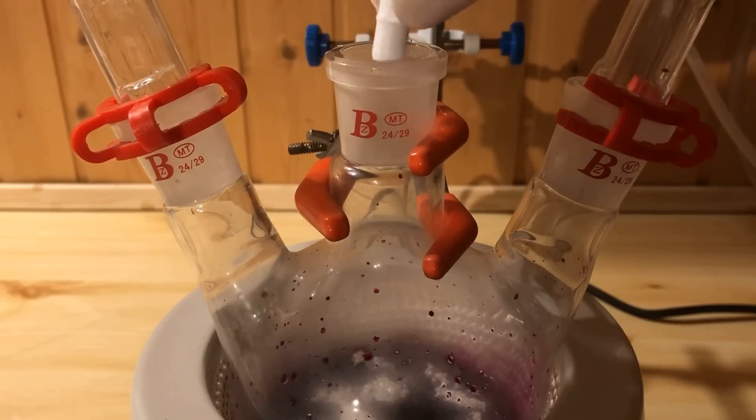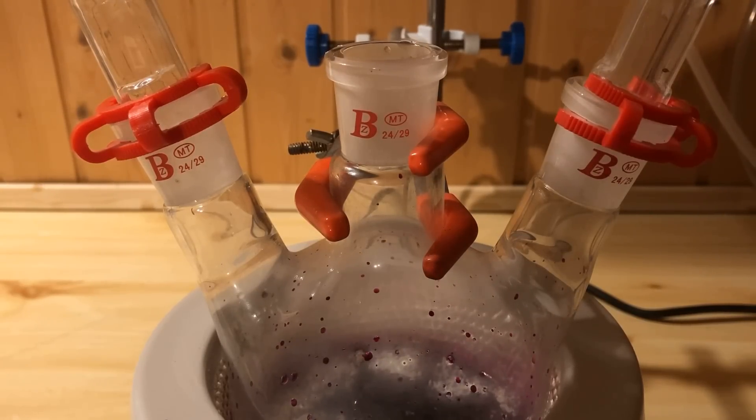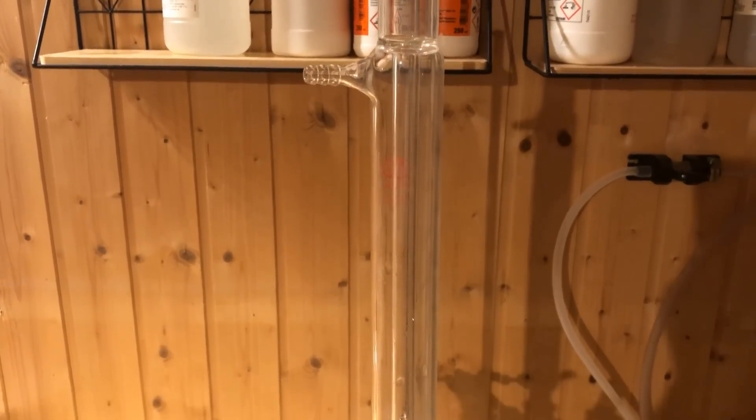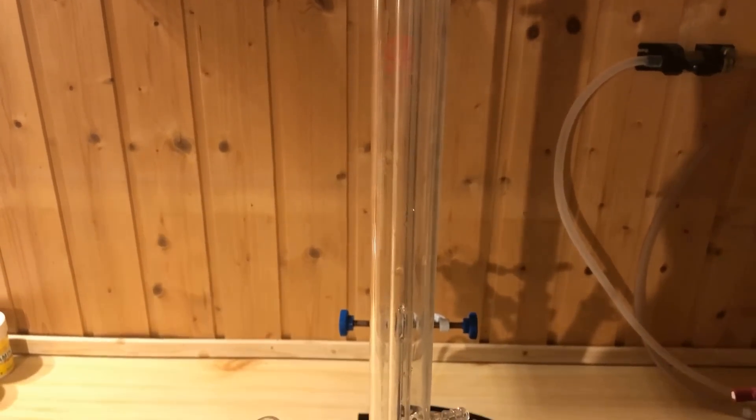After adding a stir bar, the reflux condenser is put on. It doesn't have to be a Dimroth condenser — I use a Liebig condenser, which is perfectly adequate.